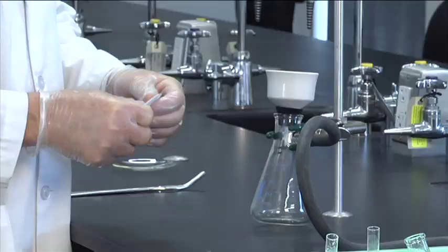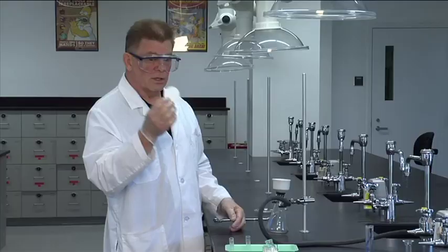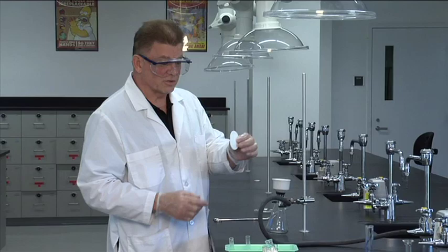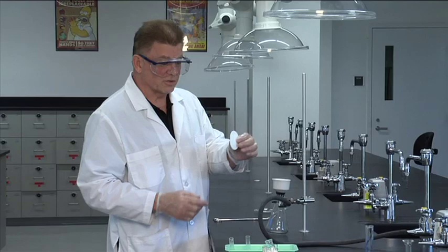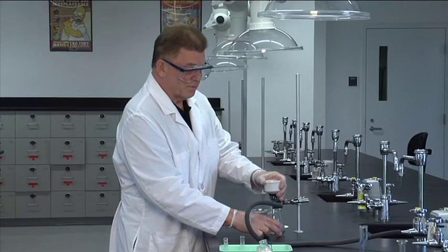You have to use the right size of the filter paper. This would be the right size for this Buchner funnel. Sometimes students will run out of this and rather than go to the stock room and ask for more filter paper, they'll take a large piece of filter paper and try to jam it in there. And that doesn't work because it doesn't make a tight seal. So don't be lazy. Get the right size piece of filter paper. Make a tight seal.